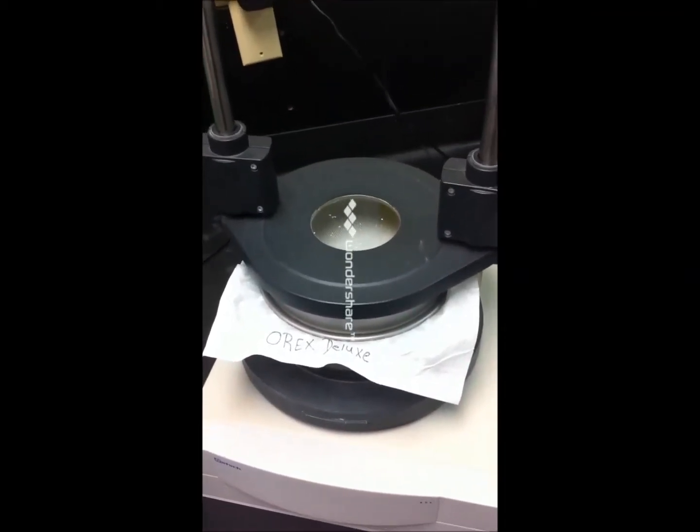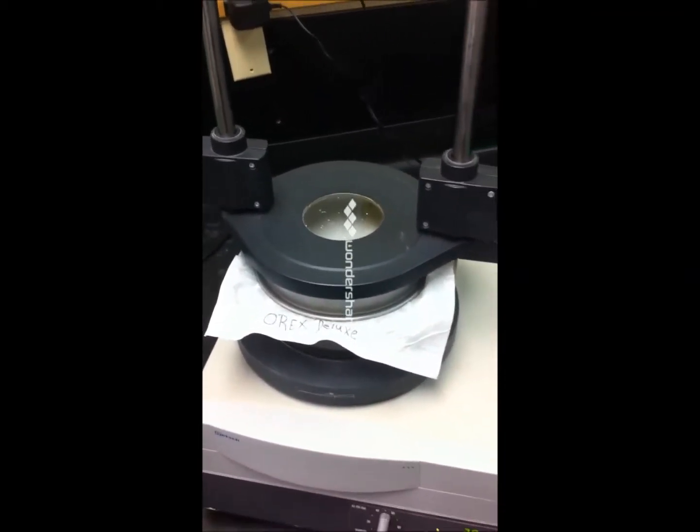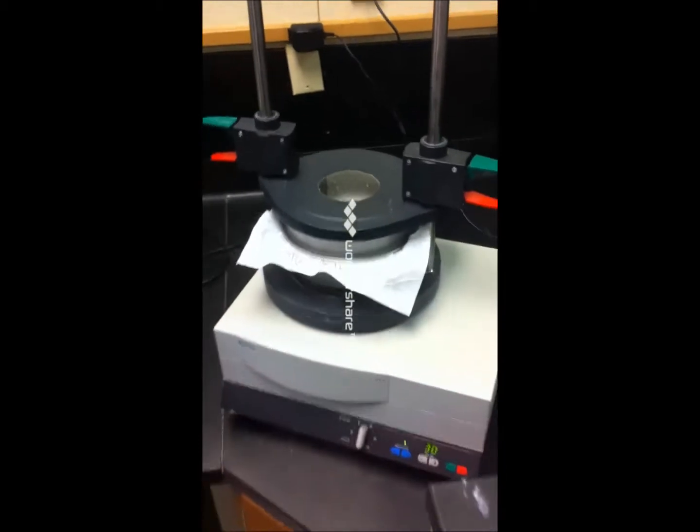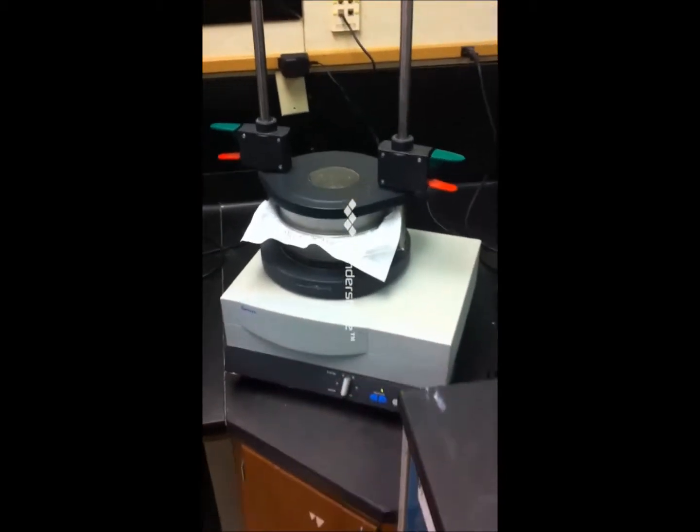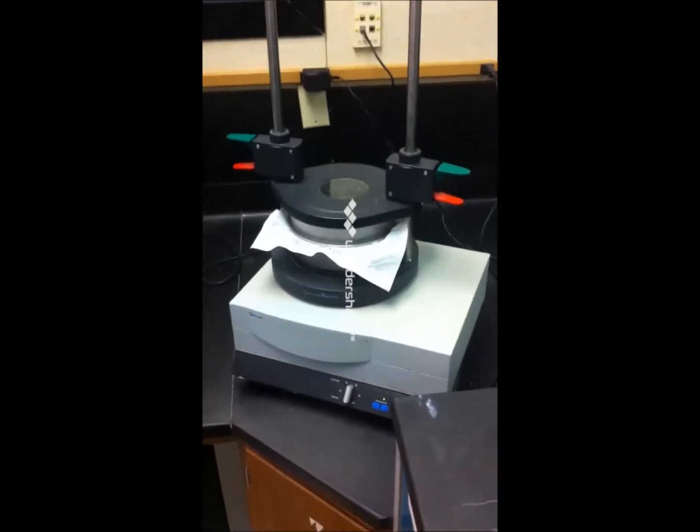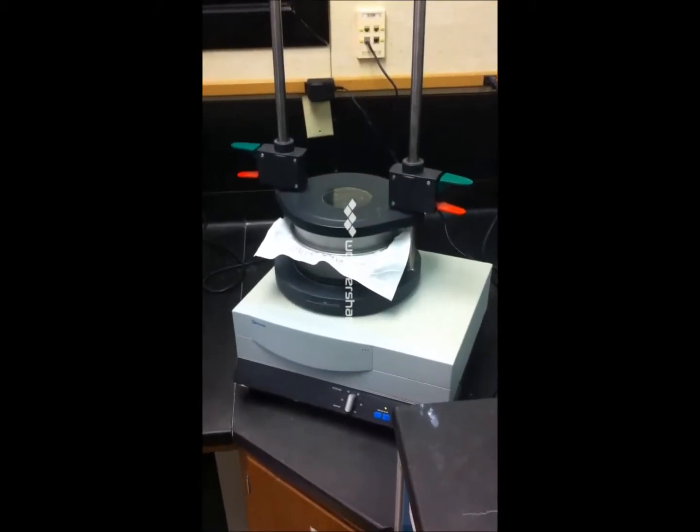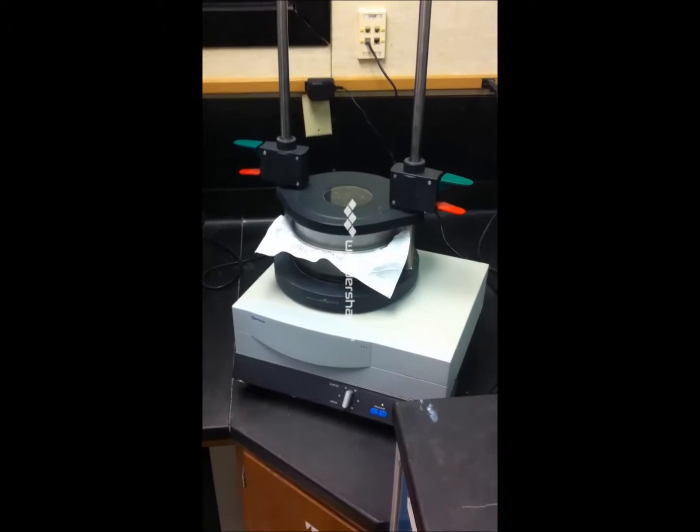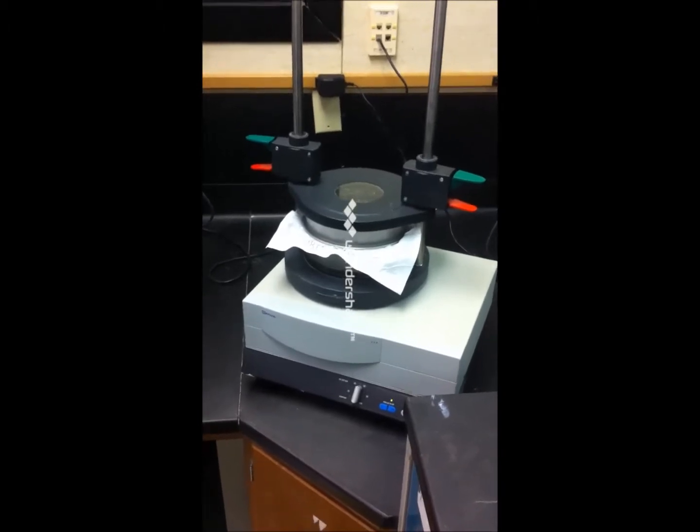We're going to remove the Orex sample out of here and see what kind of particulate penetration we got on it.